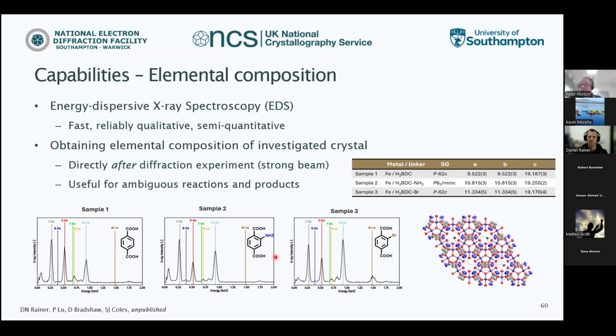interacts with the sample. Basically, just to recap a bit, the way this works is the electrons of the incident beam interact with the sample, have high enough energy to kick out an inner shell electron of all of the atoms in the sample. Then a higher shell electron relaxes down into the created hole, and this difference in energy is released as X-rays in the range of X-rays, and this X-ray is of a characteristic wavelength for this specific element, so therefore can be analyzed.